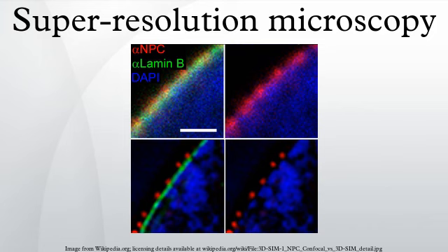number of collected photons. This fitting process can only be performed reliably for isolated emitters, and interesting biological samples are so densely labeled with emitters that fitting is impossible when all emitters are active at the same time. SMLM techniques solve this dilemma by activating only a sparse subset of emitters at the same time, localizing these few emitters very precisely, deactivating them and activating another subset.